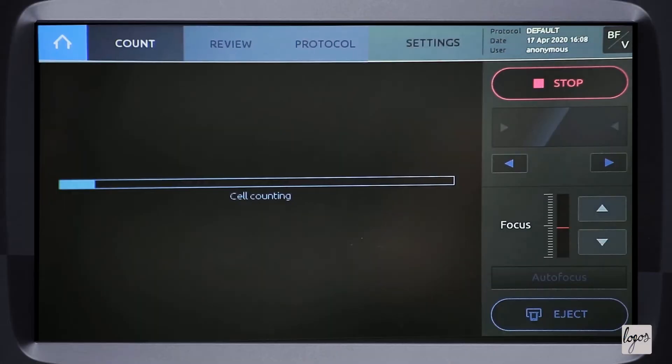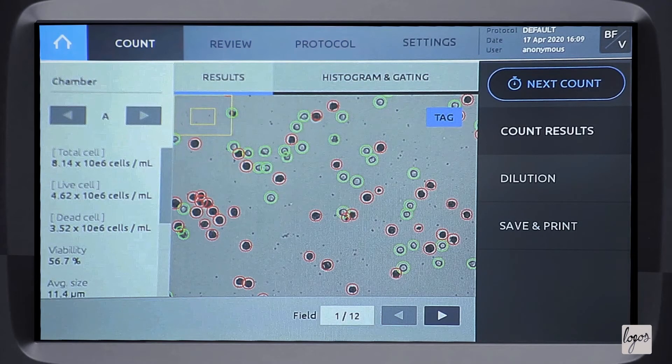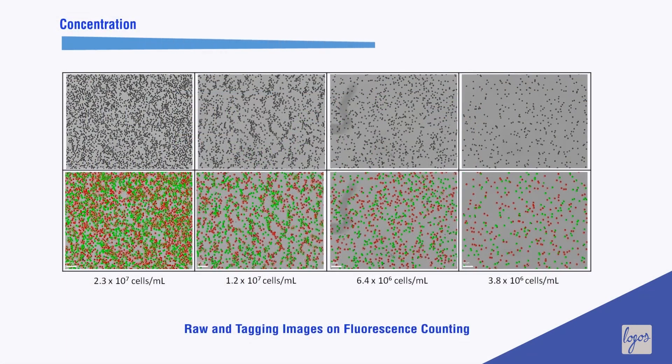With both exceptional accuracy and fast counting times, the LUNA FX7 produces reliable cell counts across a wide cell concentration range.